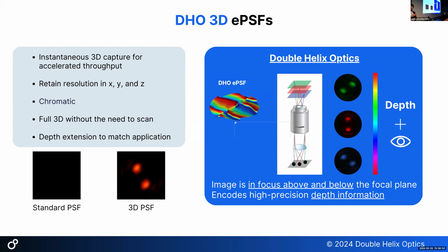It's not like you don't care if it's rotated. No, the rotation is reflected in where you are in the sample in Z. So are you near the focal plane, above the cover slip or below the cover slip? That's what the rotation tells you, where you are in the Z space. The two circles right now, are they in the same plane, or do they have different Z? Different Z, so you're representing different Z. That's right.